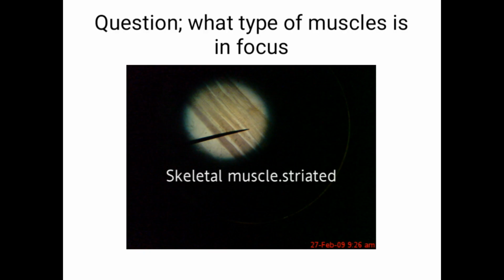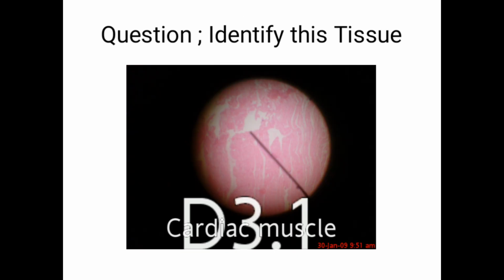They have strong striation on them. Next is the cardiac muscle, and cardiac muscle cells are branched. When you see cardiac muscle, they are branched and they have a single nucleus, uninucleated, and they have intercalated discs, these dark lines that appear, and they also have striation. Remember, there are two striated muscles, cardiac muscle and skeletal muscle, and you can find cardiac muscle in the myocardium of the heart.